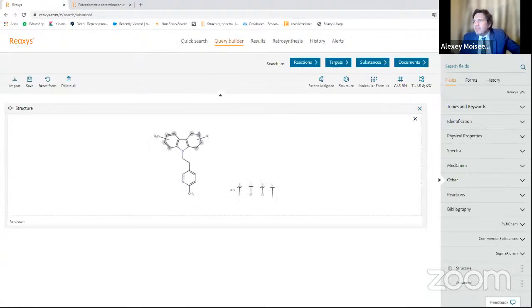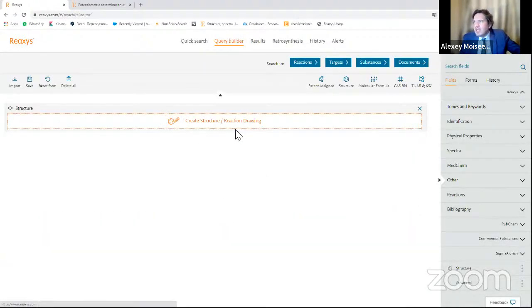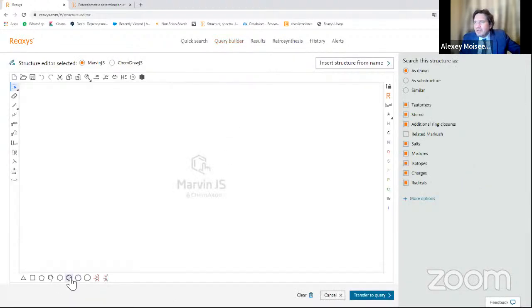If we are working with chemical reactions, we can combine, for example, structure editor search together with very specific search.